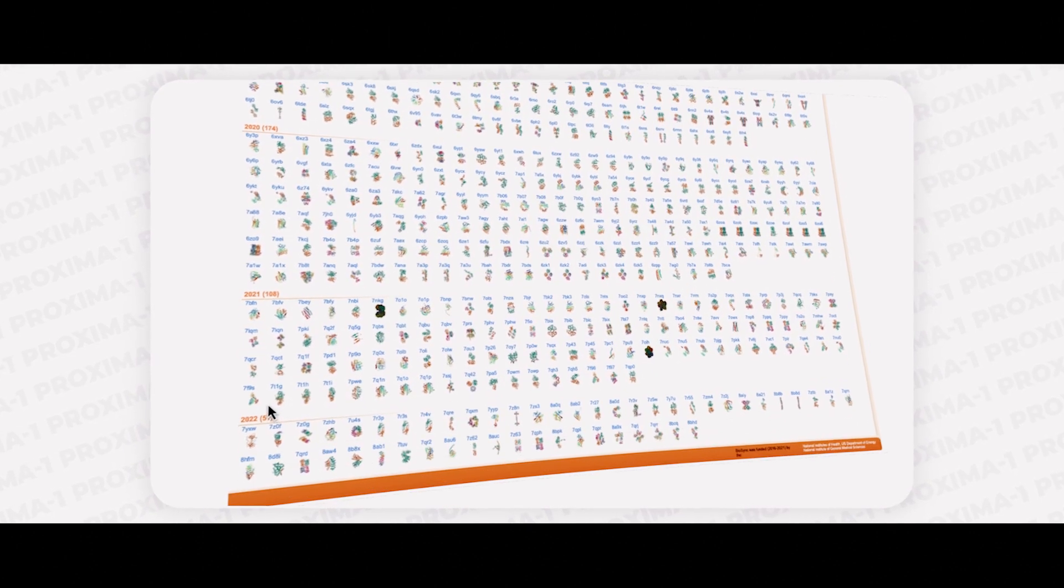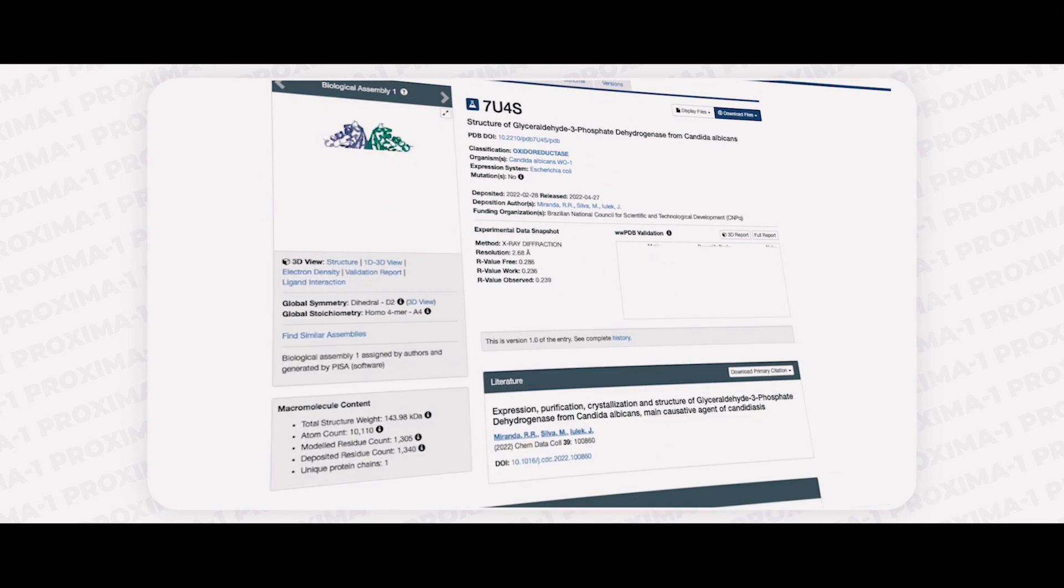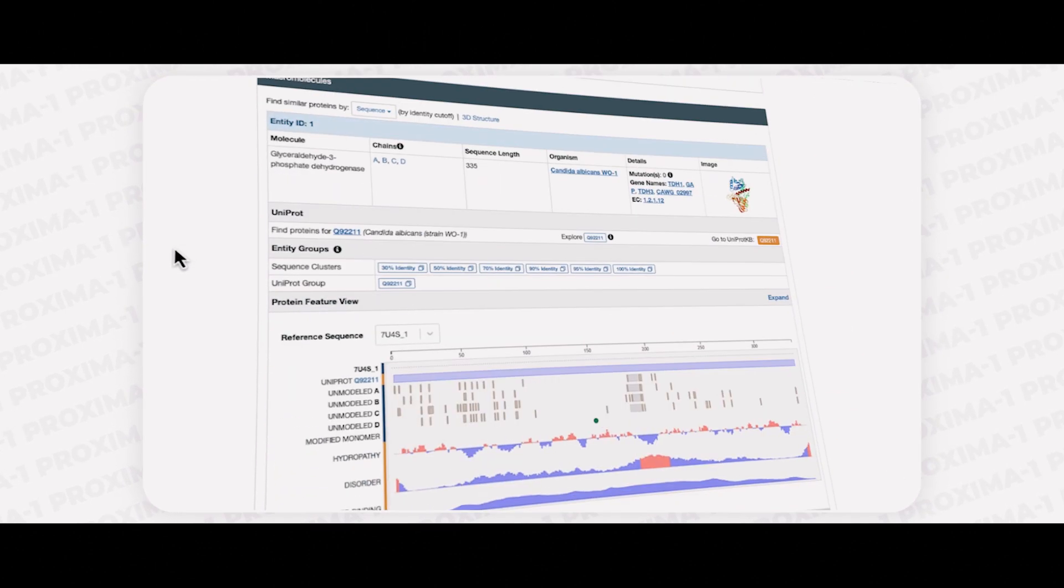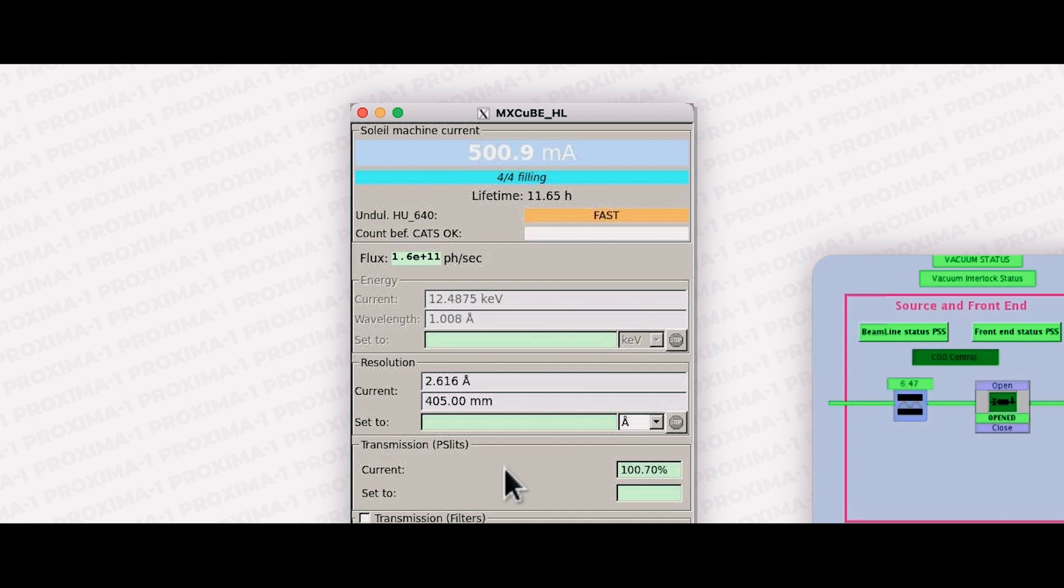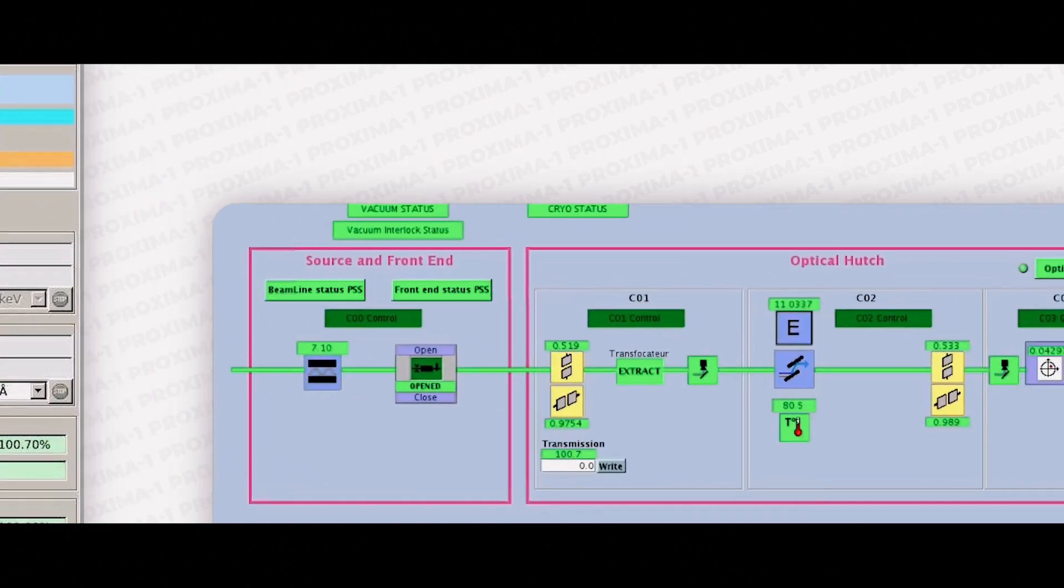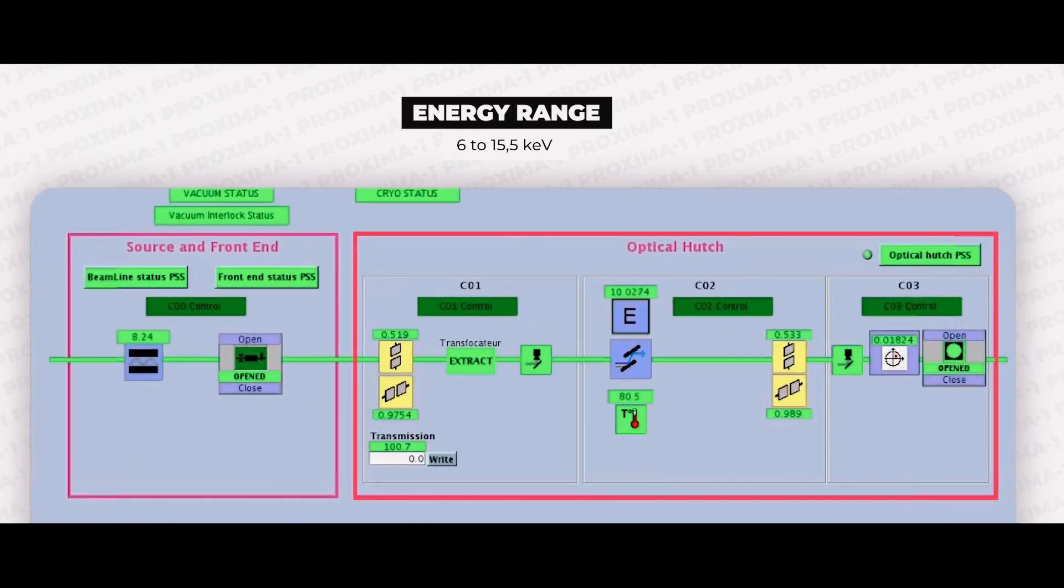Thanks to the very stable optics and to Soleil's storage ring which, when combined, allow a world-class stability and high-flux X-ray beam. A cryogenically cooled silicon monochromator allows the energy to be quickly changed between the 6 and 15.5 kiloelectron volt range.